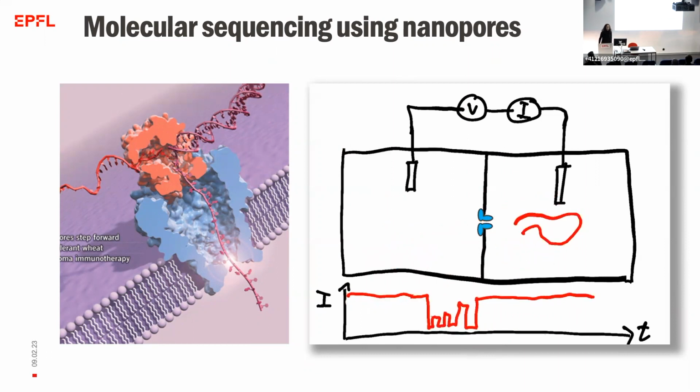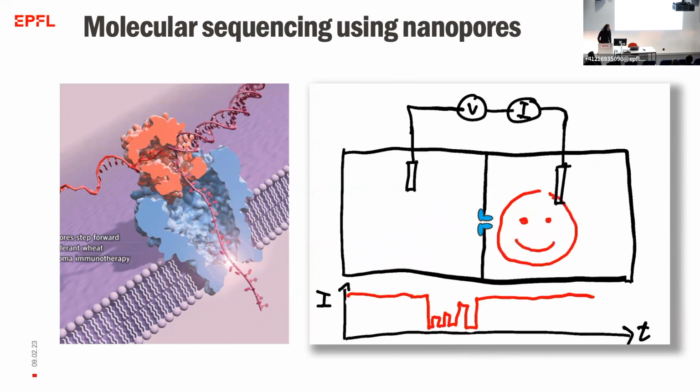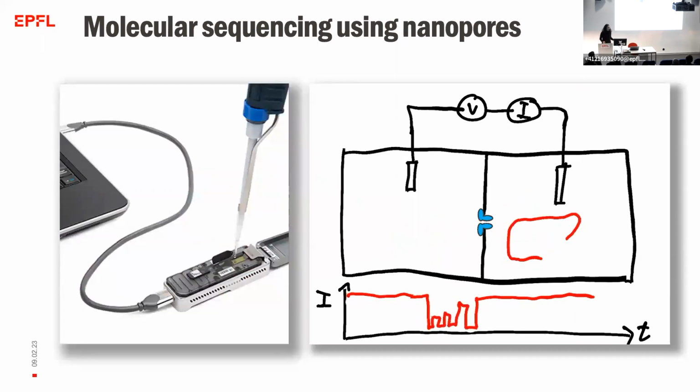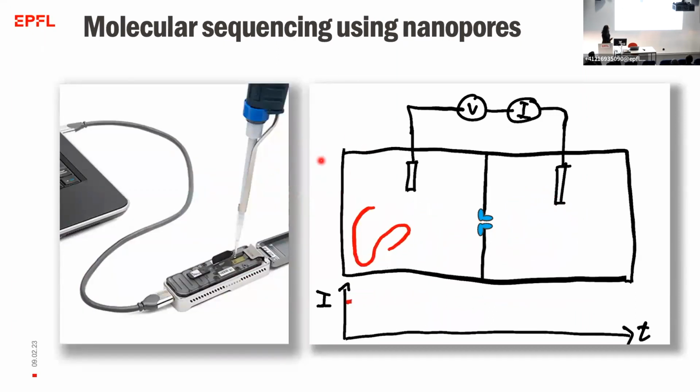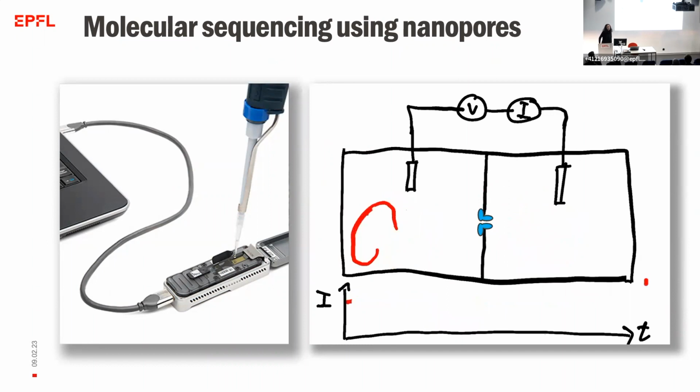And as I said, we tried many, many different things, from optical tweezers and magnetic tweezers in other labs, and atomic force microscope in other labs, but nothing was working so well. So coming to the successes of nanopore sequencing, it is a really successful technology, but it still has quite a high error rate compared to Illumina or optical methods. But it has many advantages.